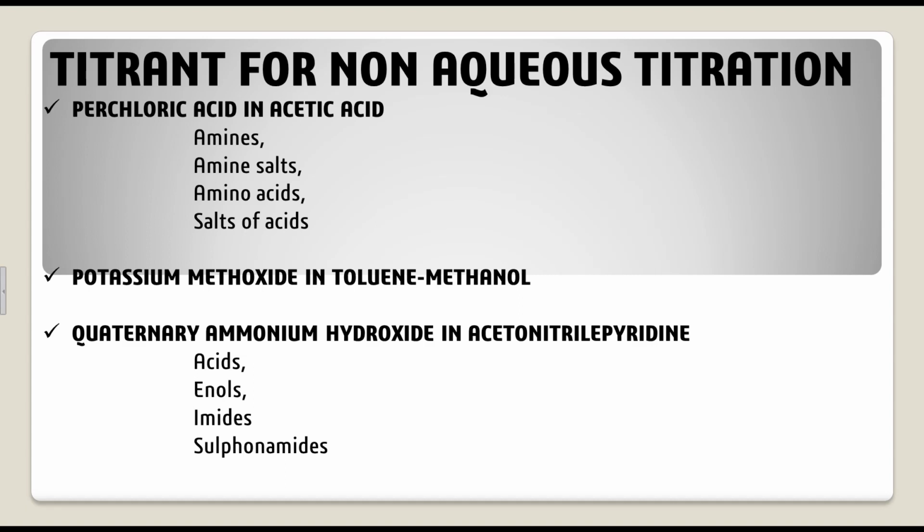In this, we saw what types of solvents are available in non-aqueous titration, what titrants are available in non-aqueous titration, and what is meant by the leveling effect. These are all the things you need to know when we talk about non-aqueous titration. I hope this video is useful when it comes to the meaning of non-aqueous titration.